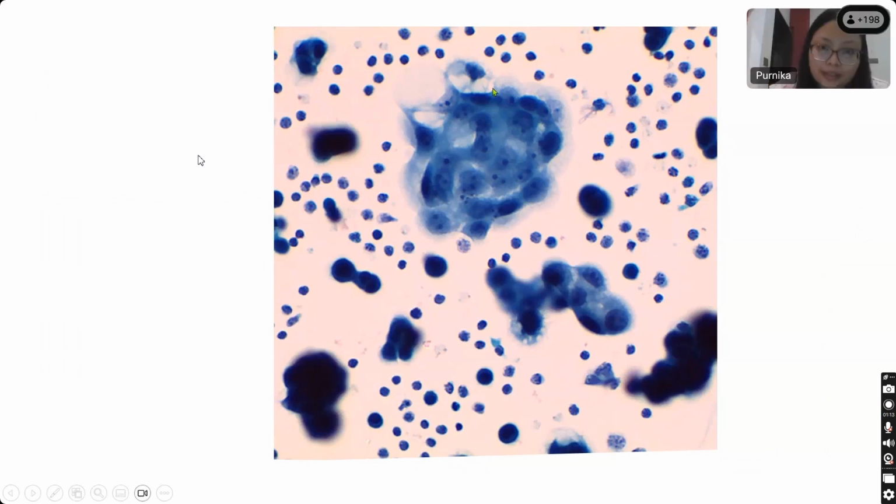Ma'am, these are cells which are arranged in clusters with the nucleus. Each nucleus is showing a very prominent nucleolus. Prominent nucleoli and, ma'am, scant amount of cytoplasm. So do you feel that this belongs to the family of mesothelial cells? The cells that we have been seeing before in the past pictures? Are these mesothelial cells or they are some alien cells? Start looking for the morphological features, the margins, the windows, the clasping effect, the nucleoli. Ma'am, I think it is still the reactive mesothelial cells, ma'am. Yes, so these are still reactive mesothelial cells, although the previous ones were looking a little atypical.